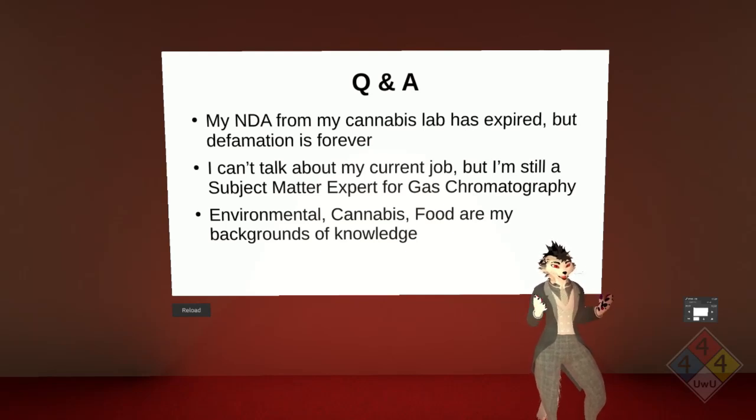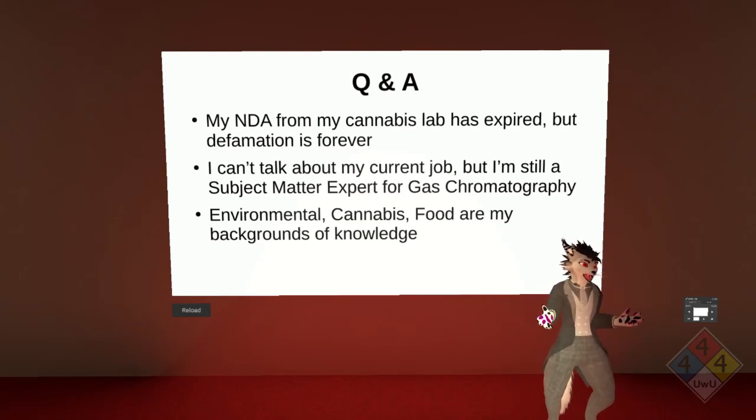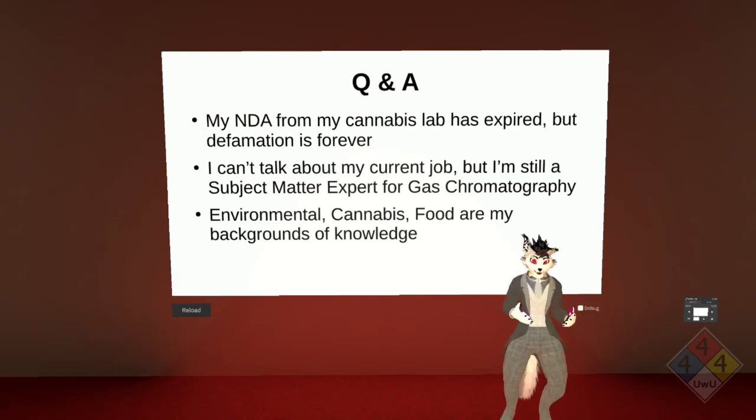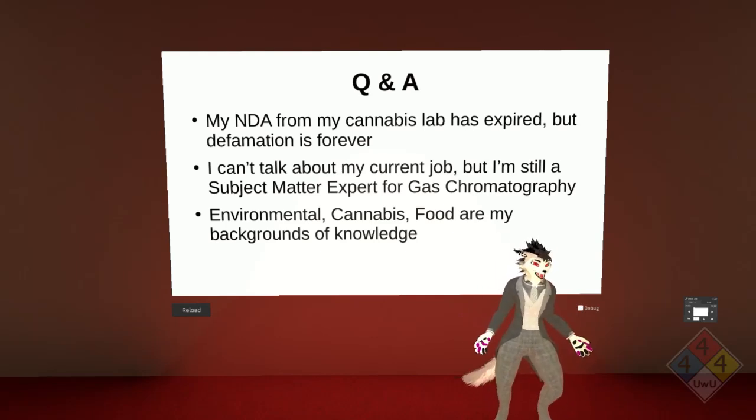And in the testing, you need to differentiate it. I think that really GC-FID would have been very able to do total cannabinoid testing. And there were some large arguments for it at the beginning of the market, where that was all that's necessary. But better isn't the right question to ask here, right?